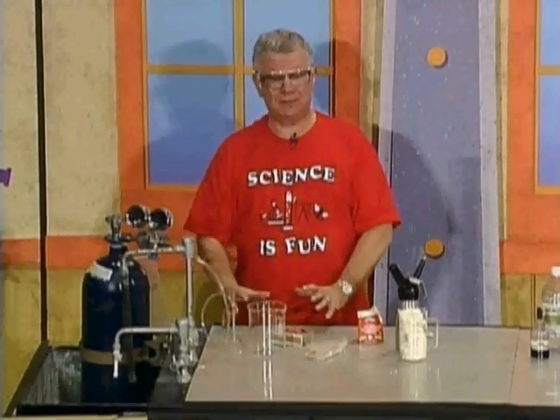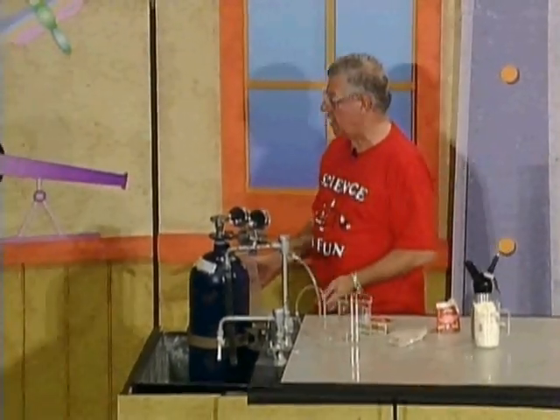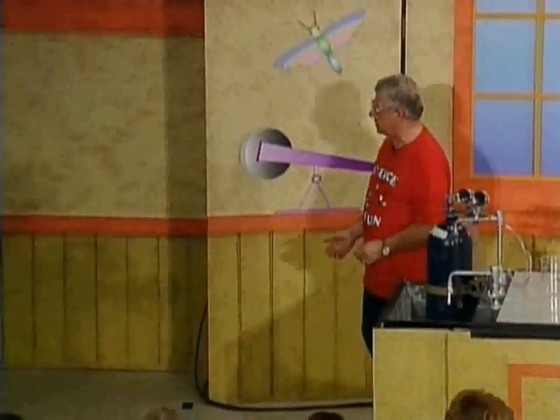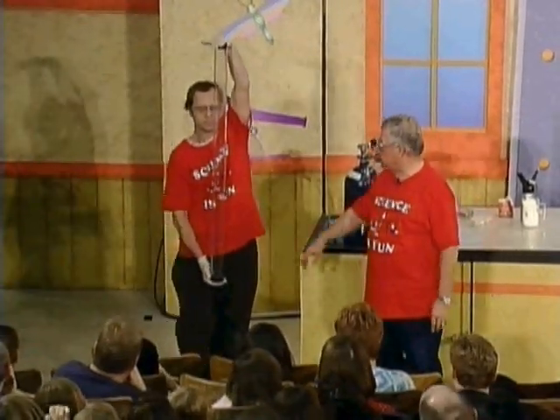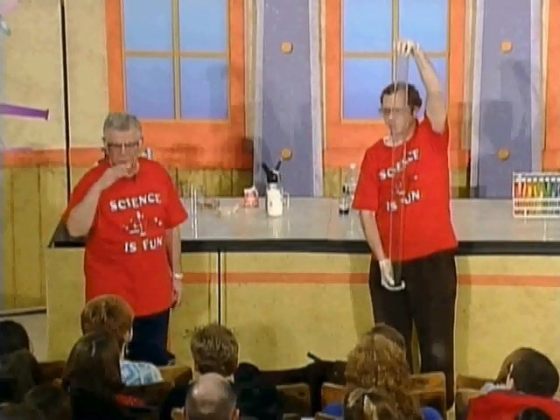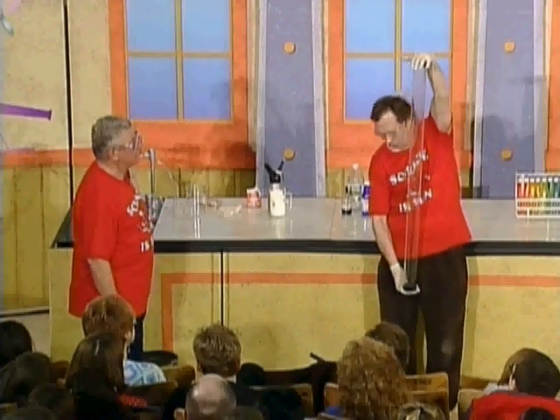The next experiment has to do with nitrous oxide inside a very long glass tube, brought out by Jim Maynard. The tube contains N2O, which is invisible, but you can see some droplets from a liquid Jim added called carbon disulfide — a foul-smelling liquid. The two stoppers are in place.